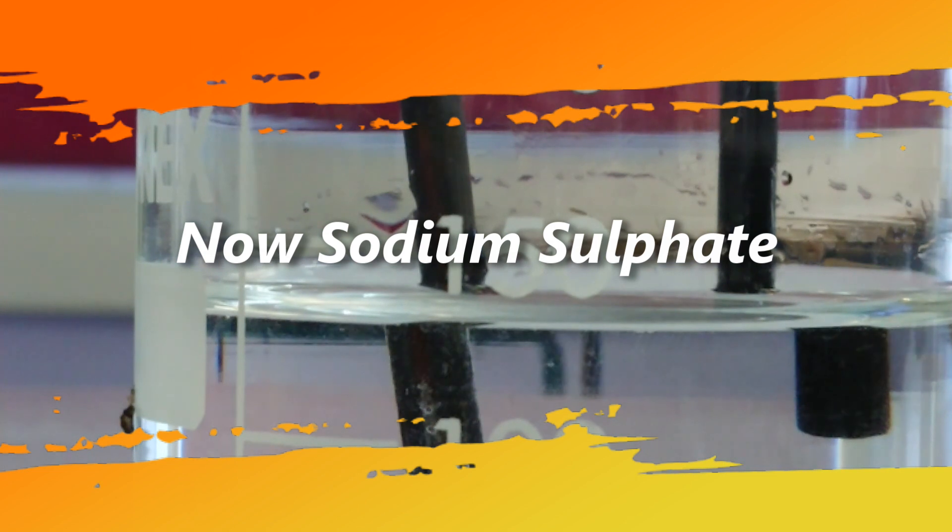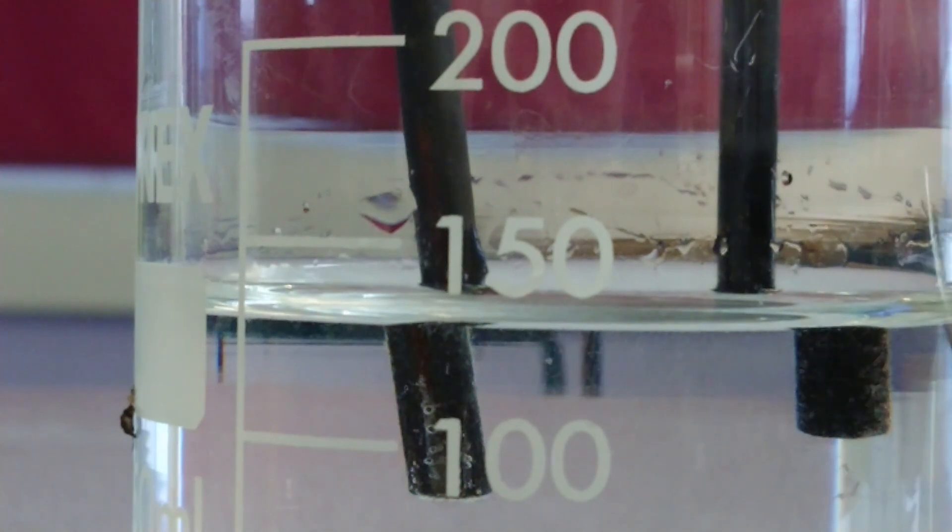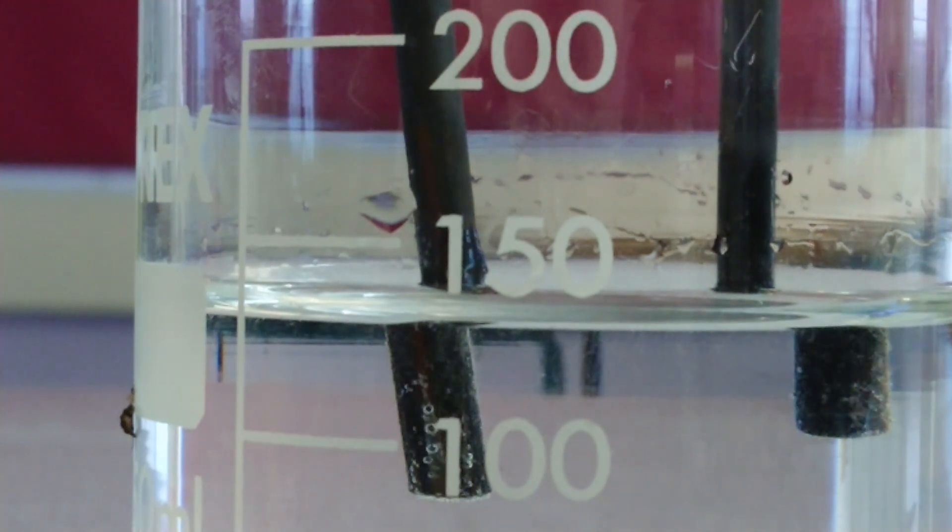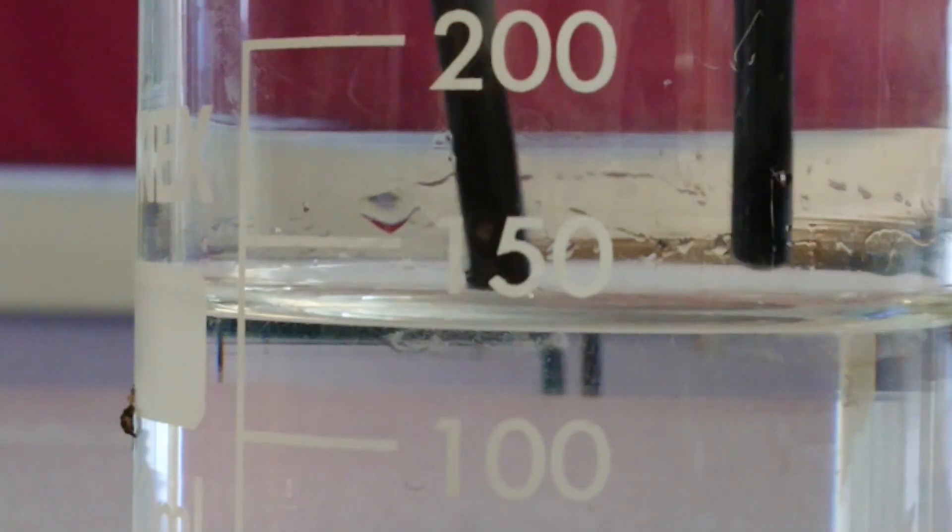So our final solution for today, the sodium sulfate. We can clearly see the bubbles coming off both the anode and the cathode. Let's test the gas at the anode and see what we've got.